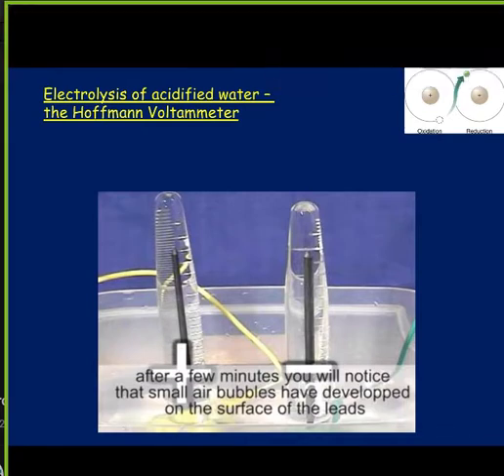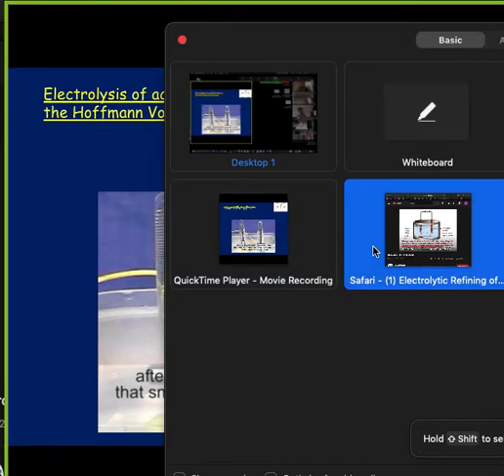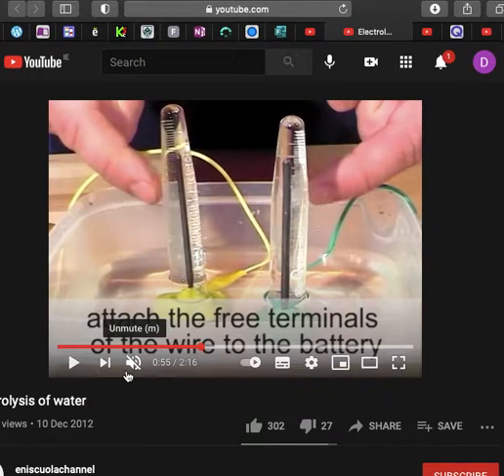So I need to change my share. New share. This one. Okay, so this is a homemade version of it. Can you remember this? Did you do it with the little tiny Hoffmans, or did you do it with the big giant one? You remember?